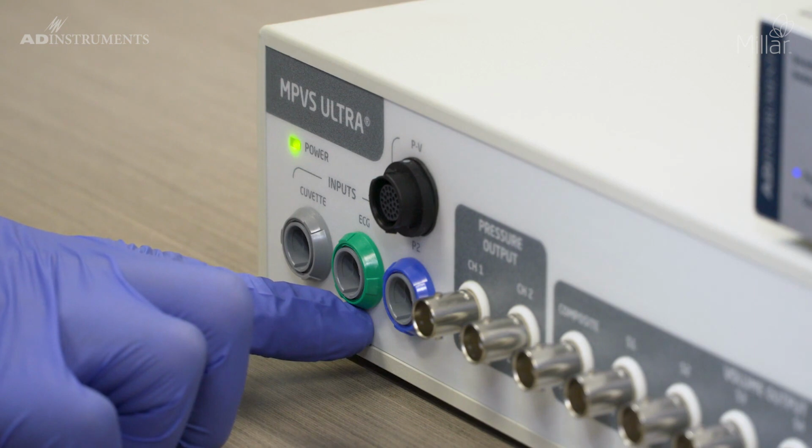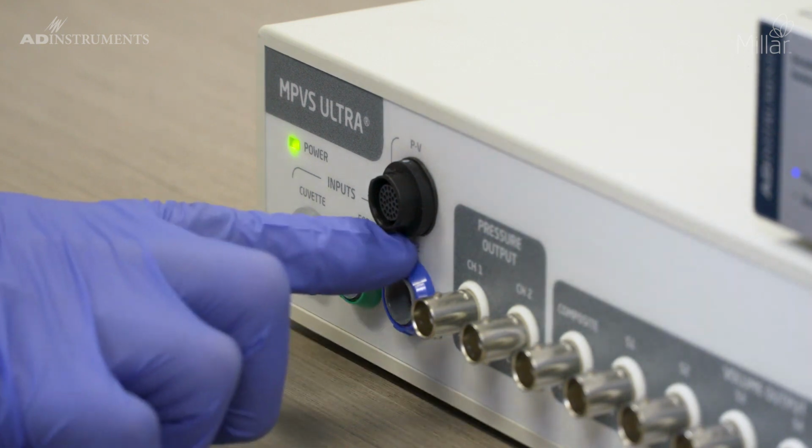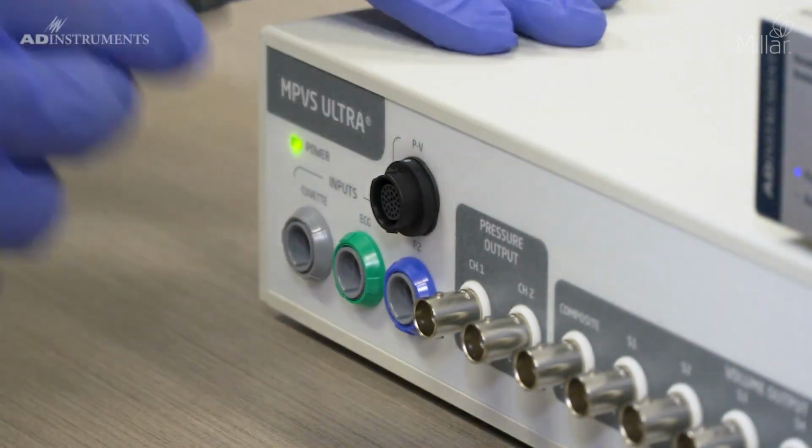The green connector is used for connecting the external ECG through an interface cable and surface electrodes. The blue connector is for connecting a second pressure catheter, or for when a dual pressure PV catheter is used. Finally, the black connector is for connecting the PV interface cable, as shown here.